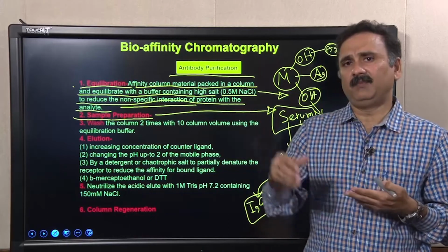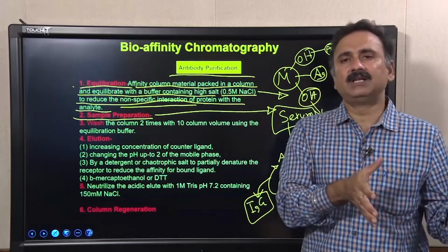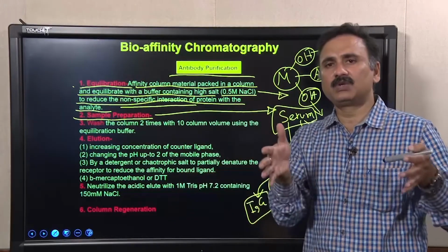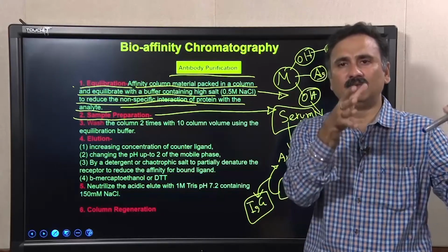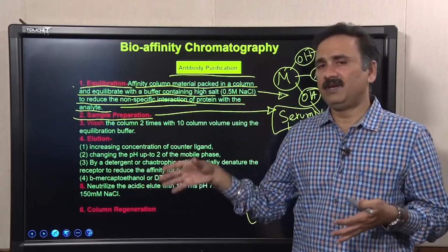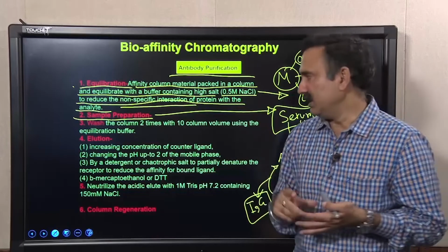In the second step, when you do another round of ammonium sulphate precipitation, you can selectively collect the IgG fractions after leaving the BSA and other protein fractions, and that is how you concentrate the samples. You are only going to have the IgG fraction now. From this fraction you can perform affinity chromatography utilizing the antigen bound matrix, and that is going to give you more yield.